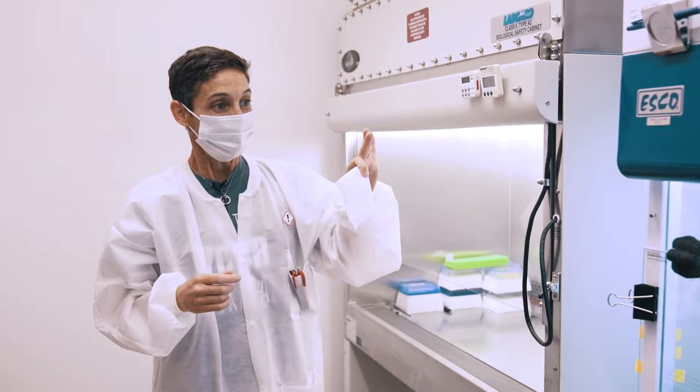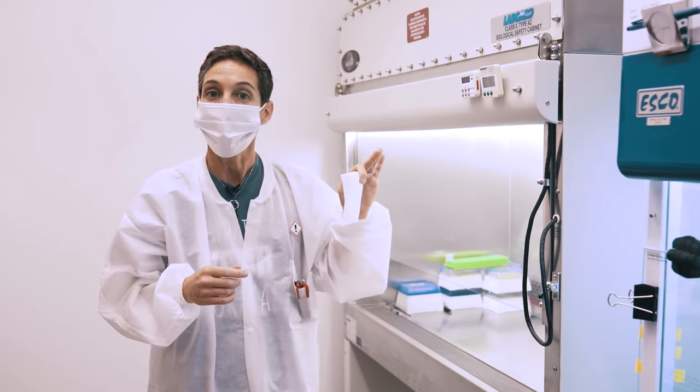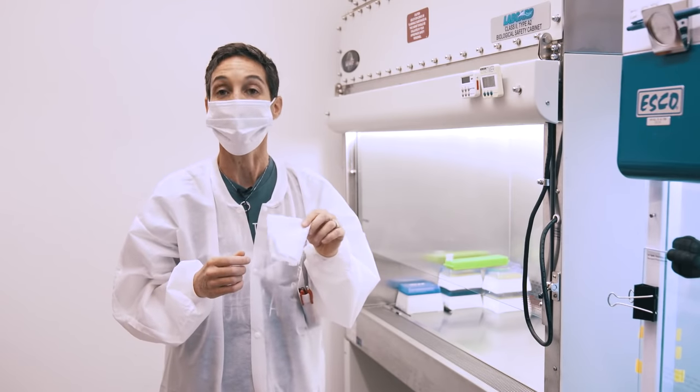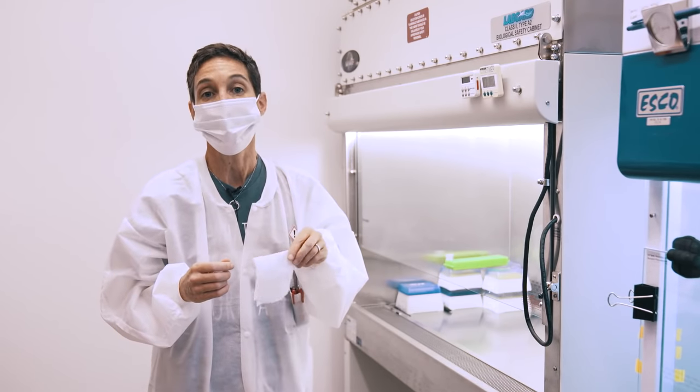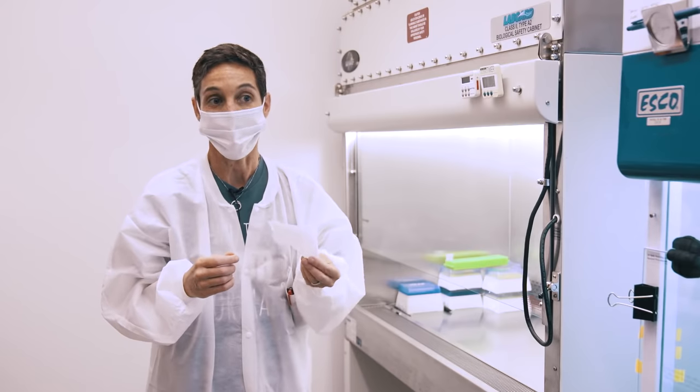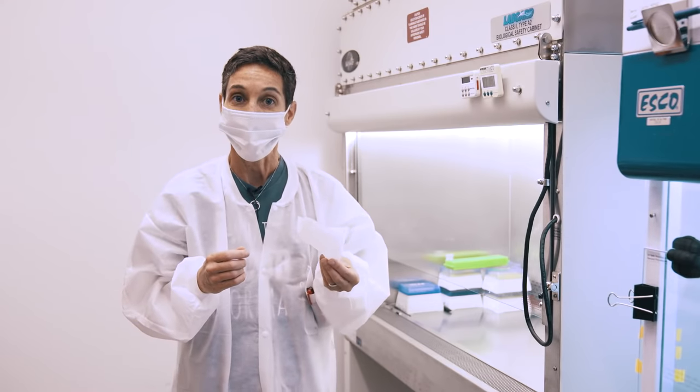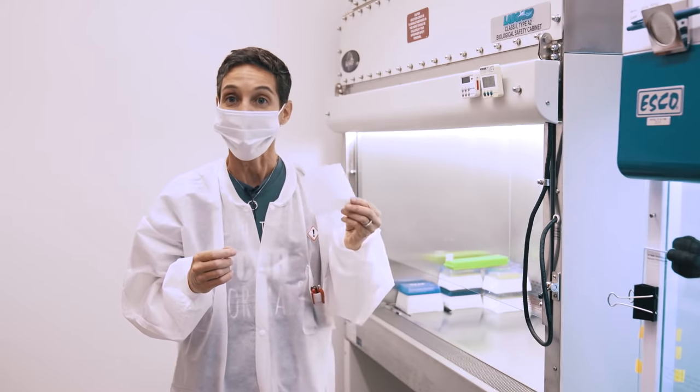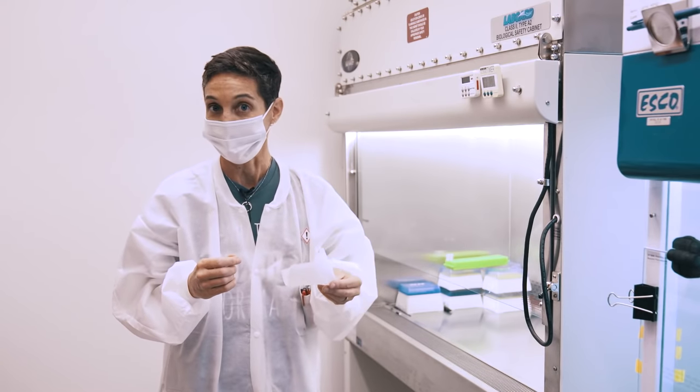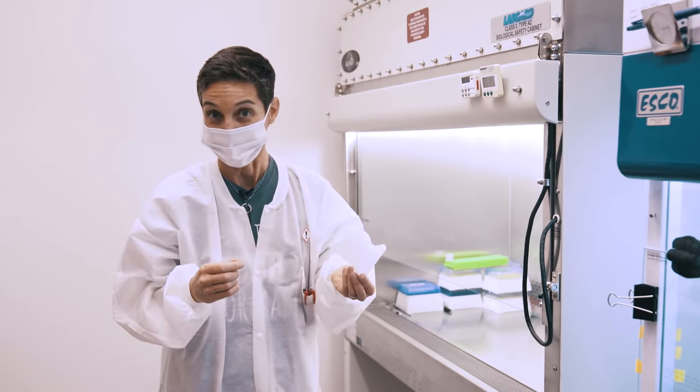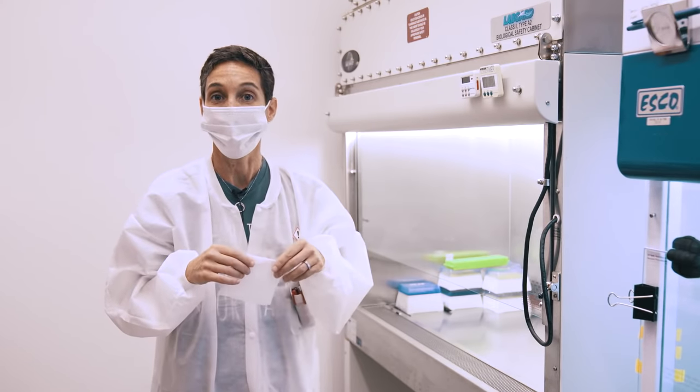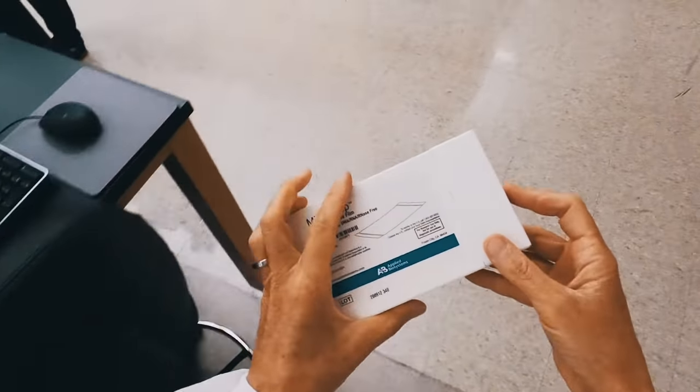So this is the setup that we generally recommend that you use. I'm going to be doing the real-time PCR setup just on a bench top. I've been doing PCR and real-time PCR for 25 years and I can get away with doing that. But we don't recommend that most people do it. It will also make filming easier for us. So we will move out to my bench where we will film putting together the reaction.